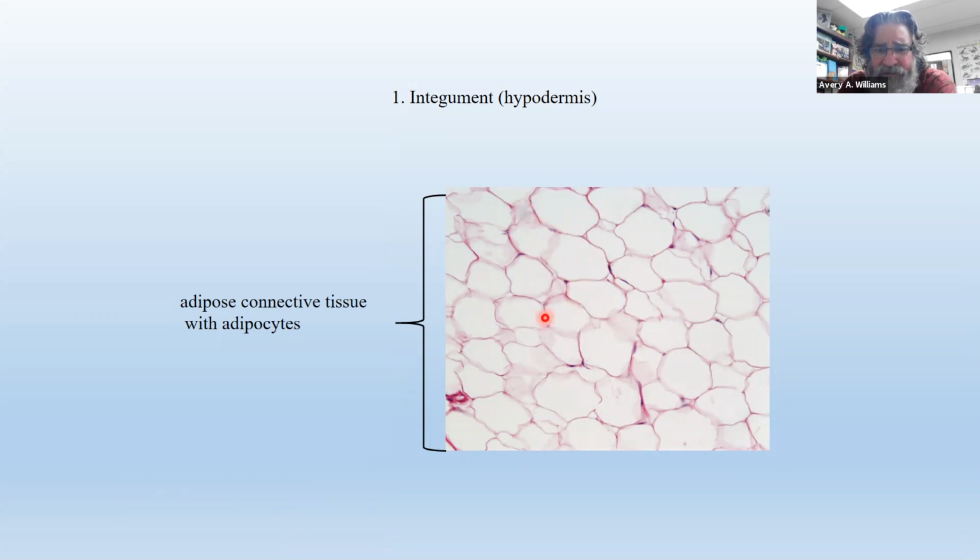You know, it kind of looks like you're looking through chicken wire or something, doesn't it? Or some people say it looks like dried soap bubbles. Or somebody says it looks like a whole bunch of little signet rings. I guess it looks like signet rings, but it's just a close up of adipose connective tissue, made of just a whole bunch of individual fat cells or adipocytes. This hollow space right here, that's where the lipid droplet used to be. Now remember, this is a thin slice cut through it. As soon as you cut it, all the stuff's going to leak out. So it's just empty. The dark little spot you see right here, there's another dark little spot there, one right there, one right there. That's the nucleus of each of the cells.